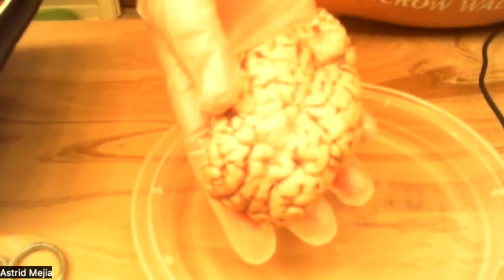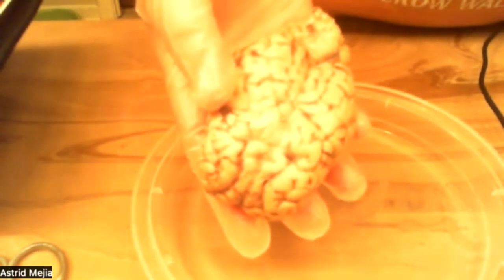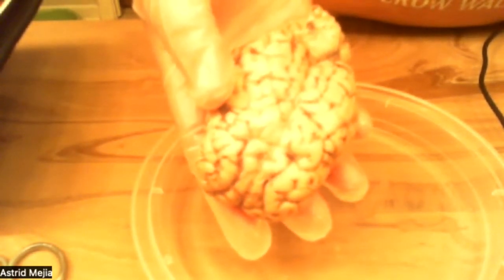And then last for this part, it would be the medulla.